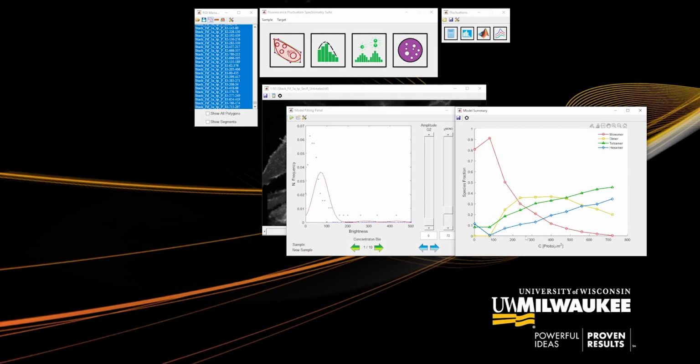From each spectrogram fit, the species fraction information is derived from the amplitudes of the Gaussians. In this specific data, we can see that the monomer, which is denoted by the red curve, is dominant at low concentrations. You should be able to see that when we look at higher concentrations, the higher order oligomers start showing up. The kinetic curves generated are great comparison tools when determining if the addition of a ligand influences oligomerization. Once the kinetic curves have been generated, the species fraction data can be saved in an Excel format. A snapshot of the graph can also be saved with the snapshot tool.